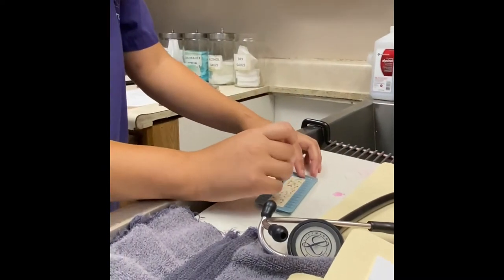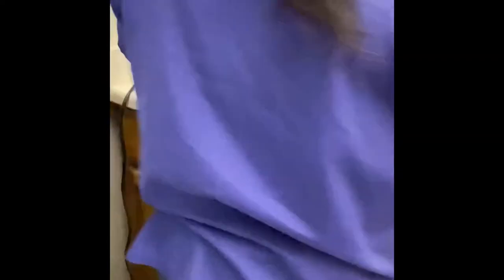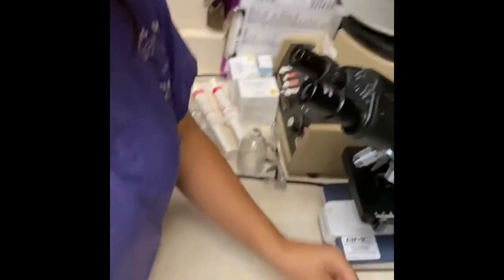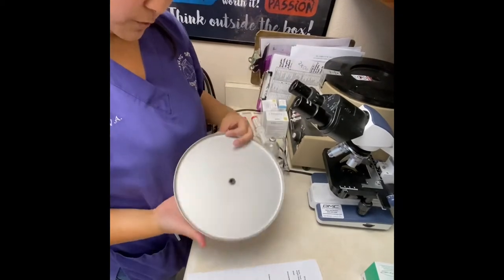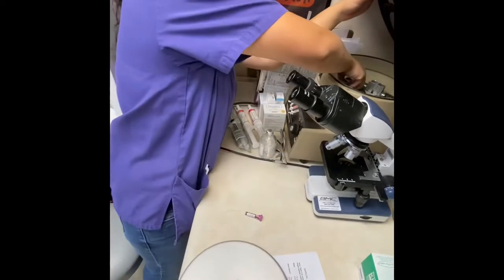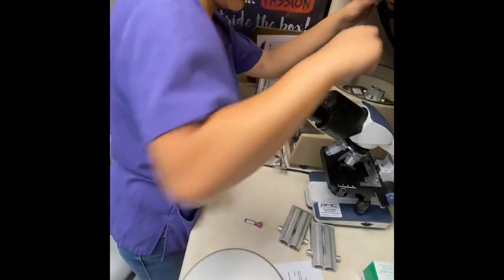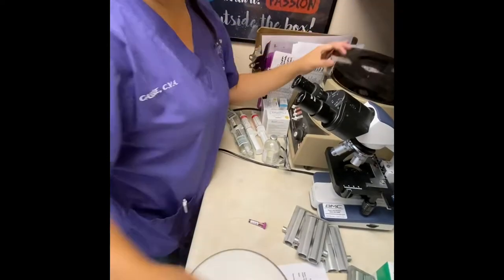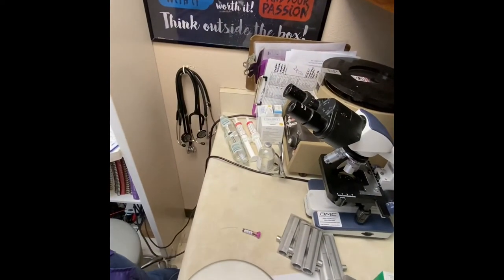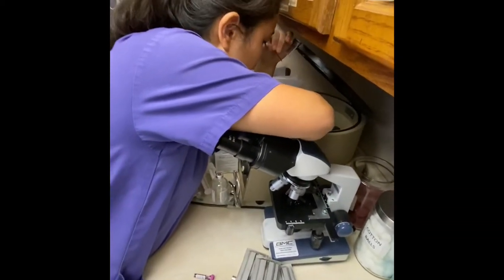All right, now that I have that, I'm going to go ahead and put them in the centrifuge. With this machine, since it can be used for multiple things, I have to take all of these out. Then I'll grab my tubes and have them clay side out, and I will put them in the centrifuge.